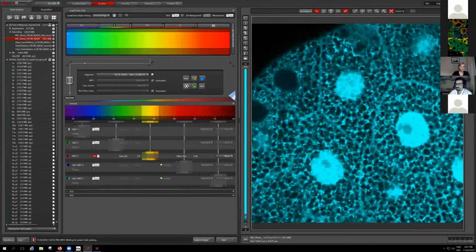And Amazi also says that the IRF should be measured when you change the objective lens. If there is no major change in the electronic or optical configuration, you can use the IRF for at least a week for the same experimental conditions: excitation wavelength, lens, etc.